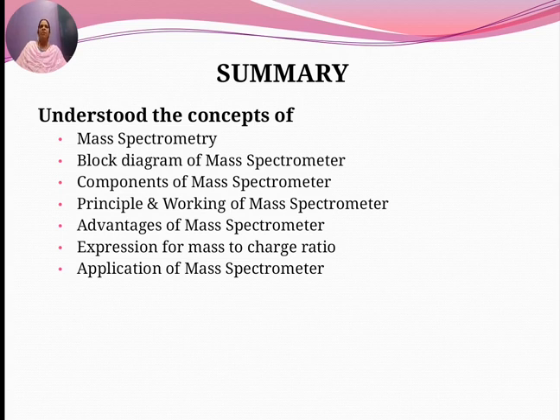So the principle is, the sample to be analyzed is first bombarded with an electron beam to produce ionic fragments of the original molecules. These ions are accelerated by passing them through an electric field. They are sorted out according to their mass to charge ratio by passing them through magnetic fields. A record of the number of different kinds of ions is called a mass spectrum. By varying the acceleration voltages, ions of other mass species may be collected. The ion currents measured in such cases would be proportional to the amount of the given mass species.